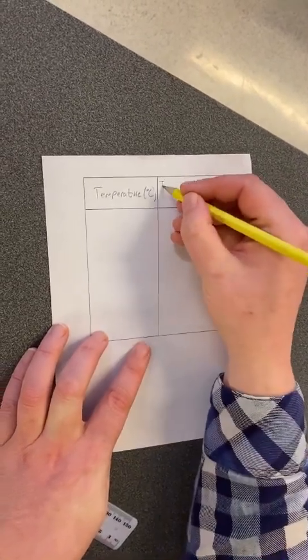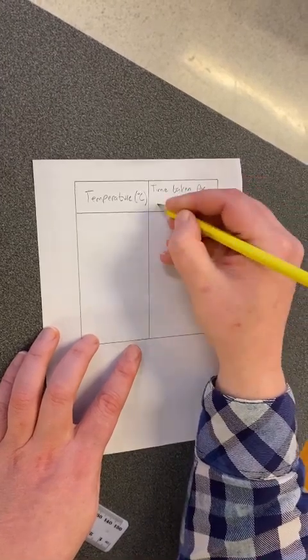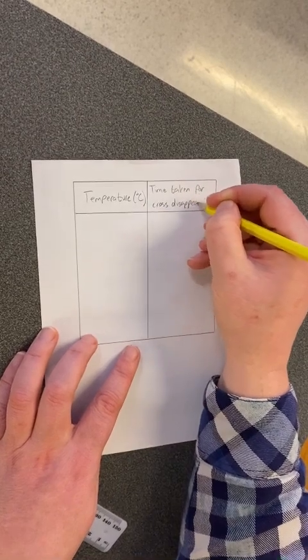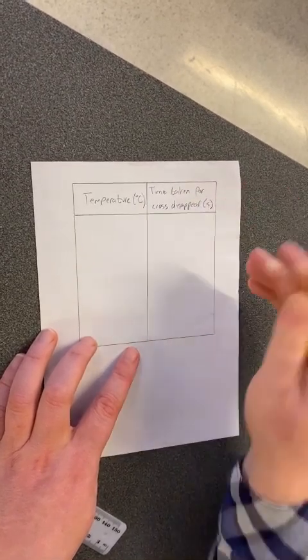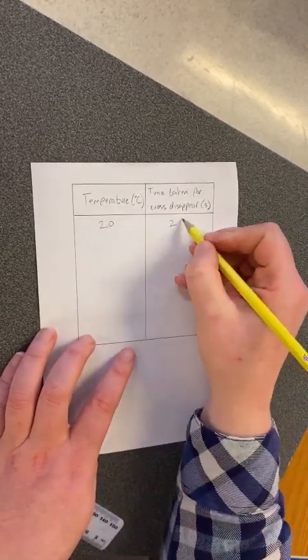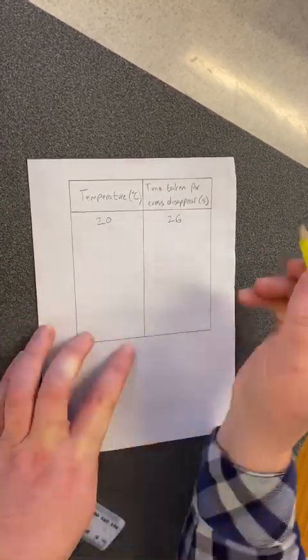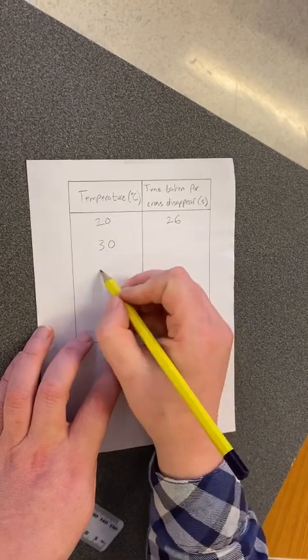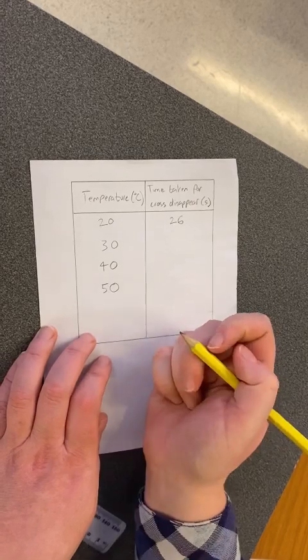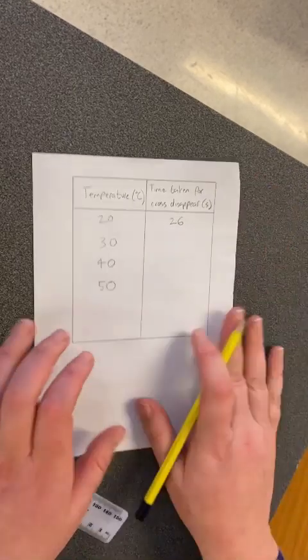In the second column, I'm going to write down what we're measuring, which is the time taken for the cross to disappear. And we're measuring that in seconds, so bracket with a small s. So room temperature was 20 degrees Celsius, and it took 26 seconds for the cross to disappear. I'm going to repeat that at 30 degrees Celsius, 40 degrees Celsius, and 50 degrees Celsius, and then we're going to have a look at the time it's taken for the cross to disappear.